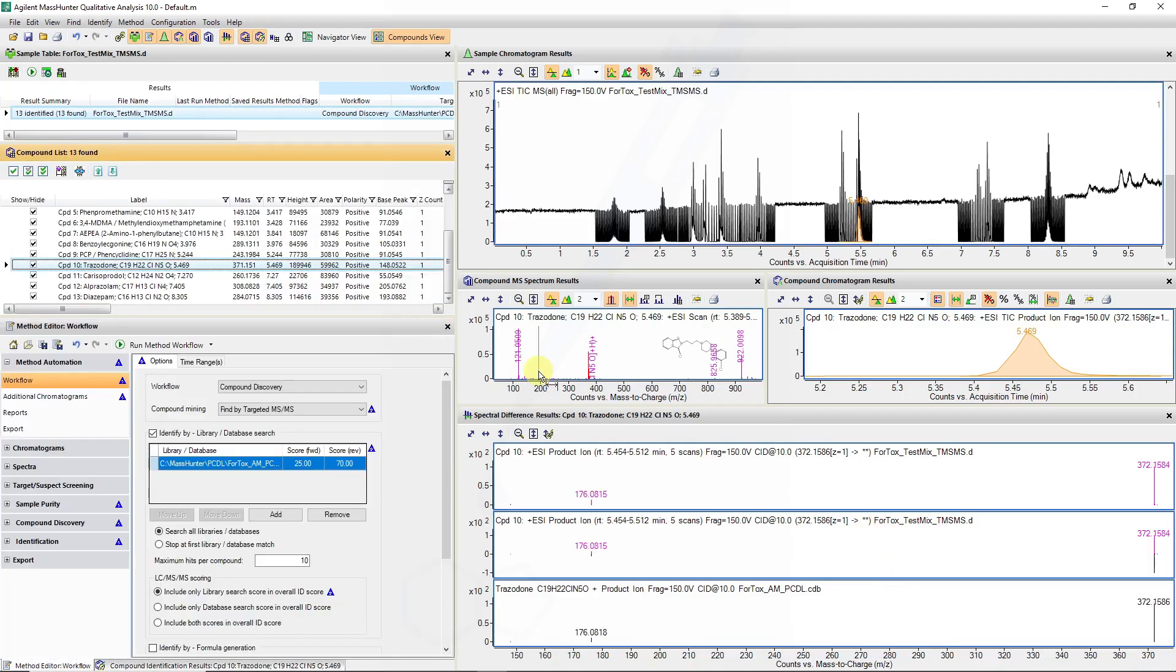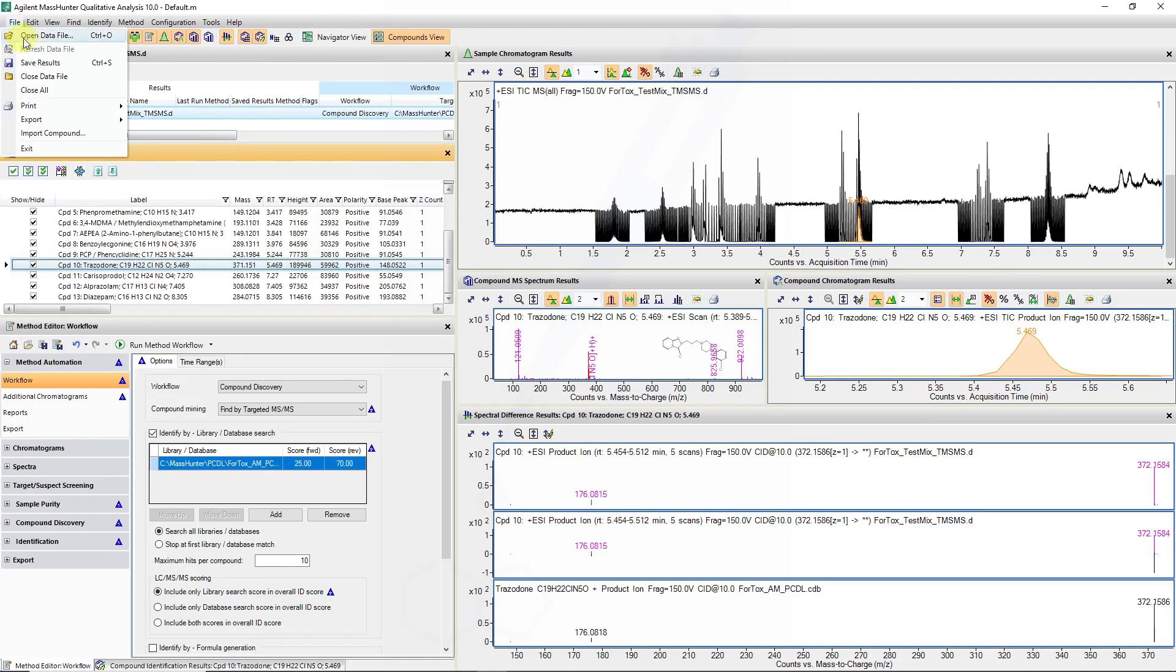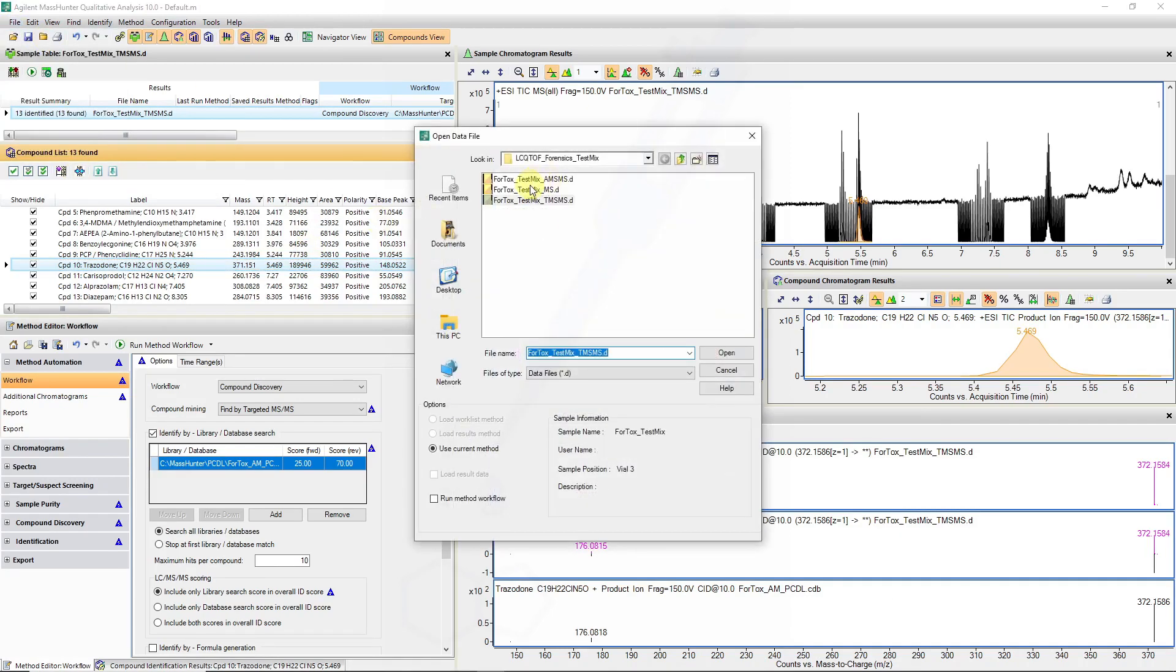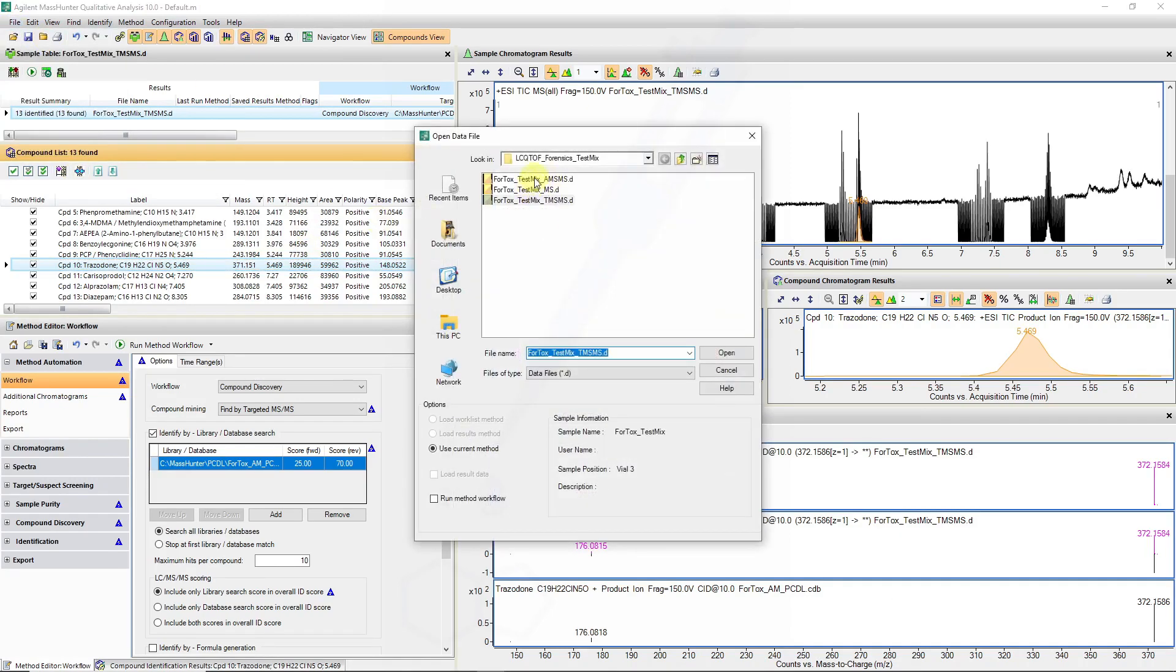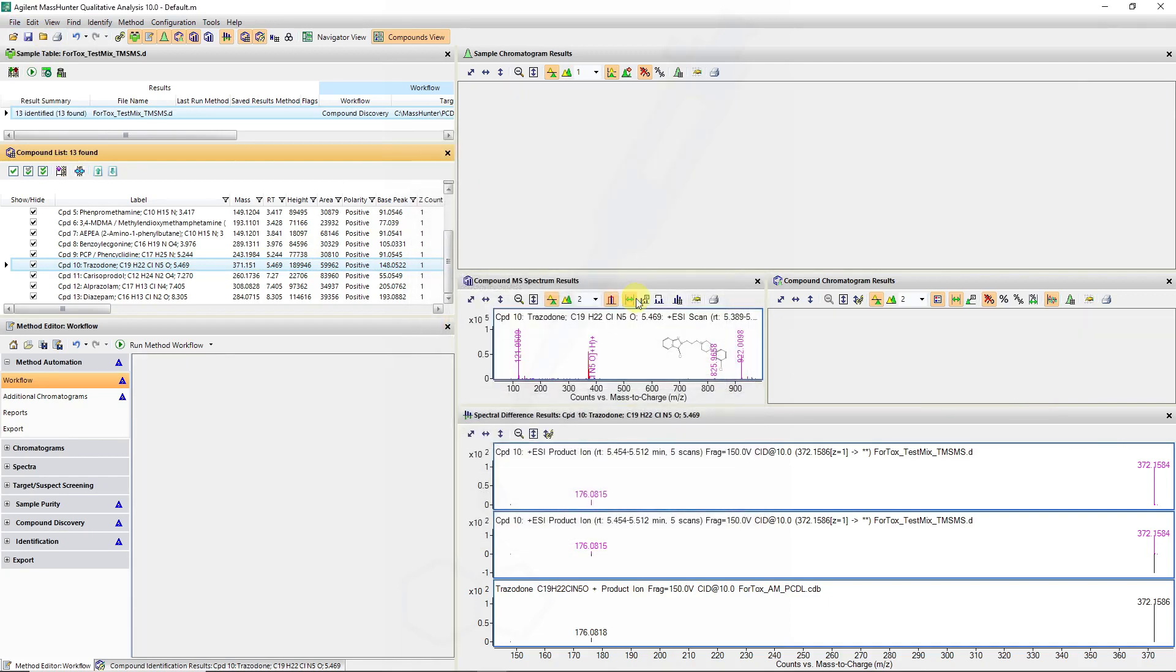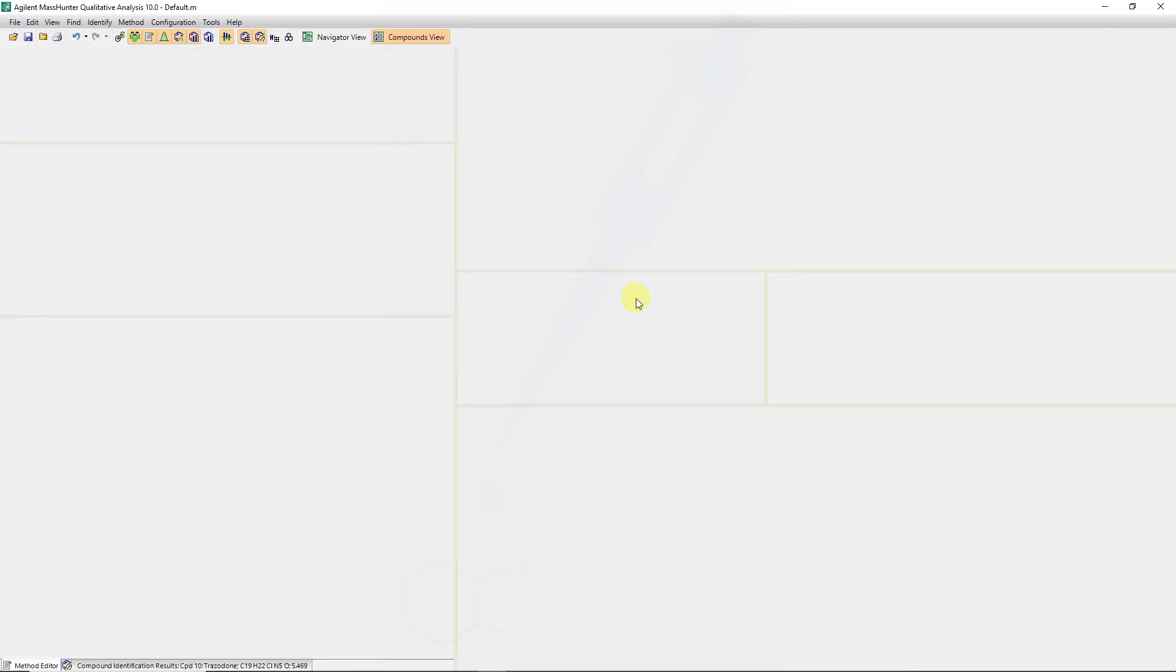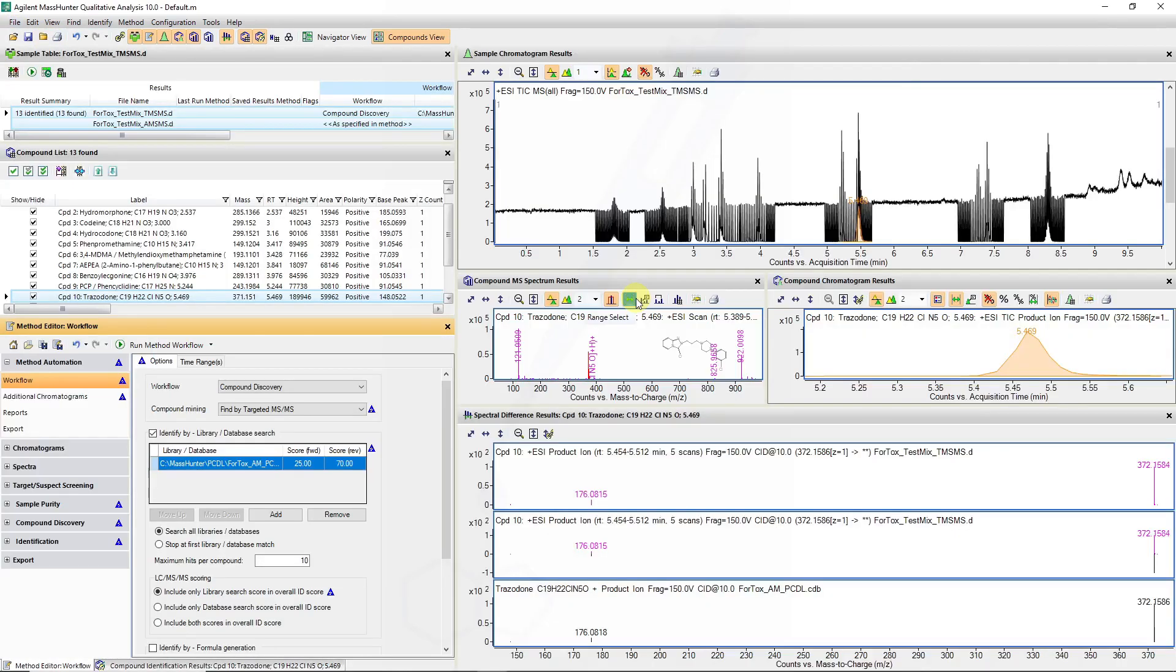Now I want to show you how the molecular feature extraction changes when we have an auto-MS-MS data file. Now remember when we're doing auto-MS-MS this is when we've either specified an inclusion list using TOF-MS data or we've just set a threshold for when precursors are selected for fragmentation.